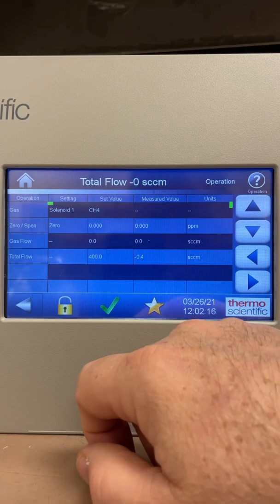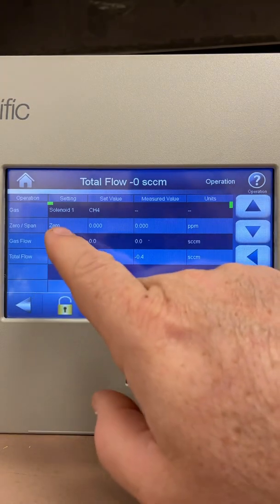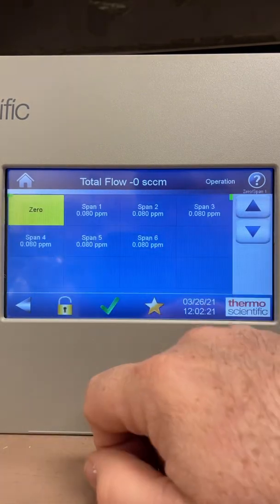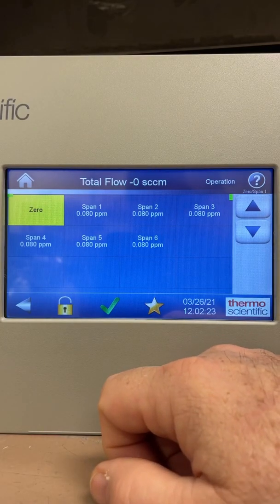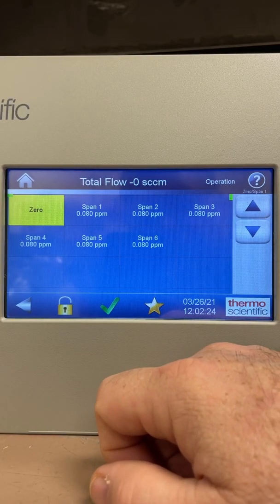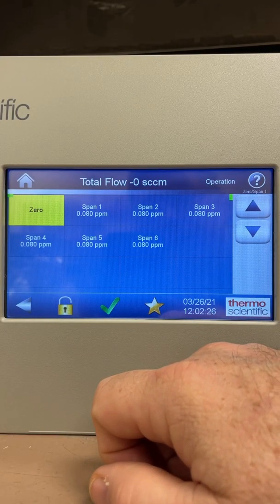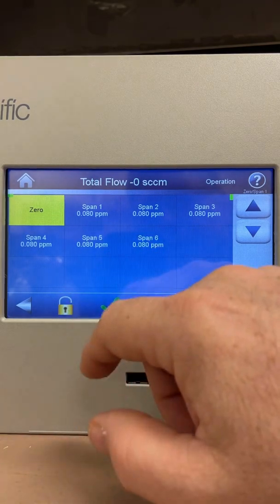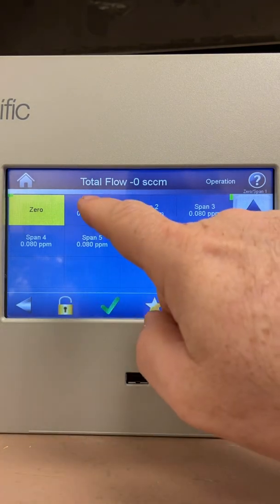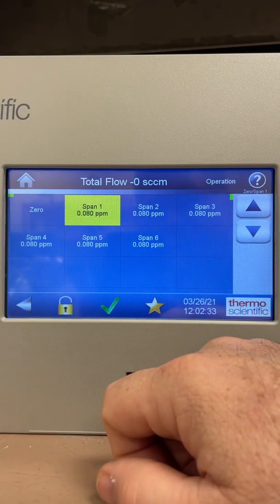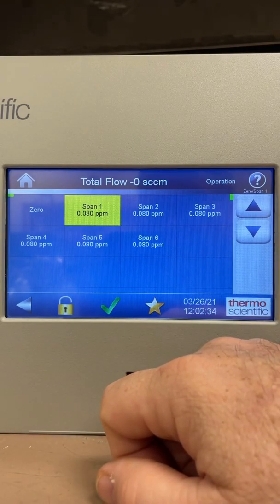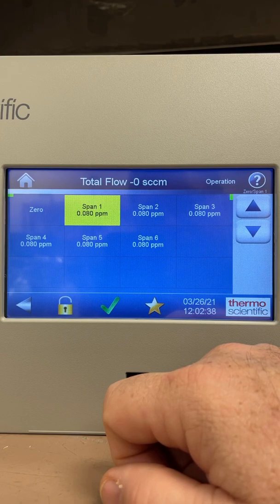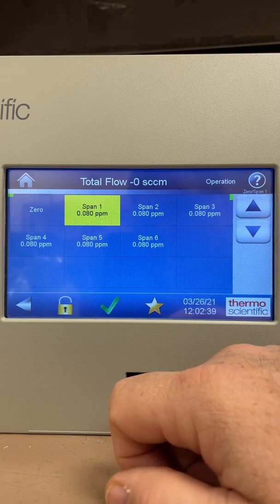If I wanted to generate a high point — currently running zero air to my methane analyzer — I just touch the zero button and up comes my different span choices set in this analyzer. They're all set for 0.08 right now. Say span 1 is my high point; I would simply pick it, hear a solenoid click — there it goes — and the span 1 solenoid is active, letting methane cal gas go into the calibrator mixing with my dilution air.